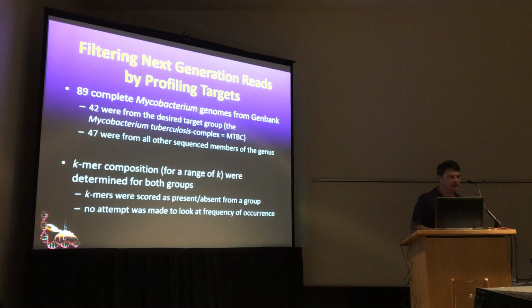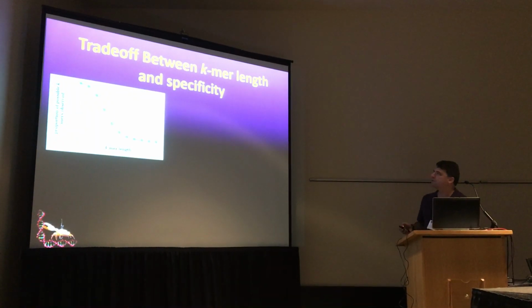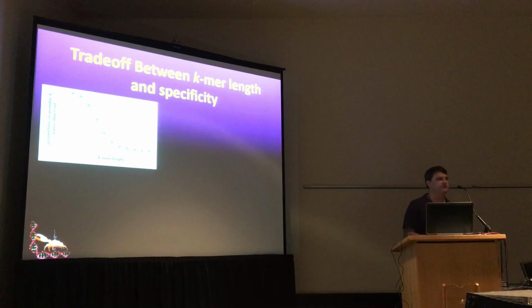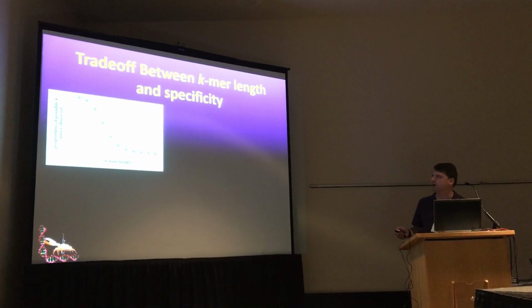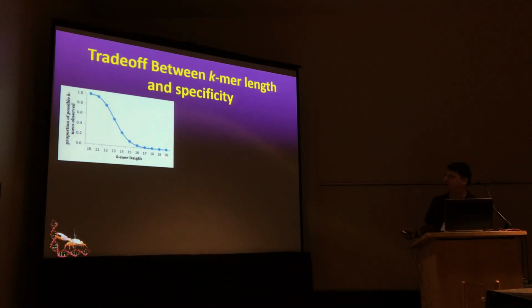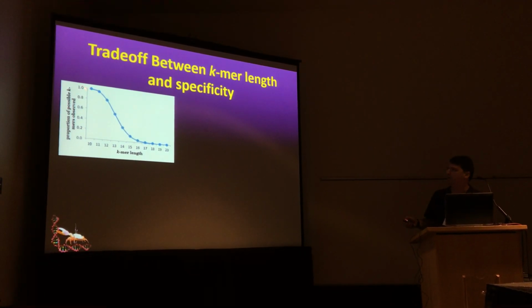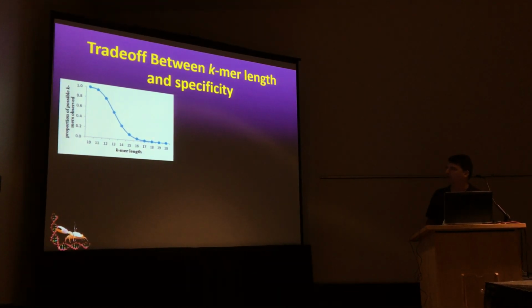Some very obvious and expected results, before we actually try to profile anything: first, not surprisingly, when K-mer length is short, let's say around 10, you find virtually every possible K-mer that there could be in the data set. It's not quite 100%, but it's very close. But as K gets longer, you start getting only a tiny fraction of all the possible K-mers. That's not surprising, but it drops very rapidly from virtually everything you can find to almost nothing that you can find.